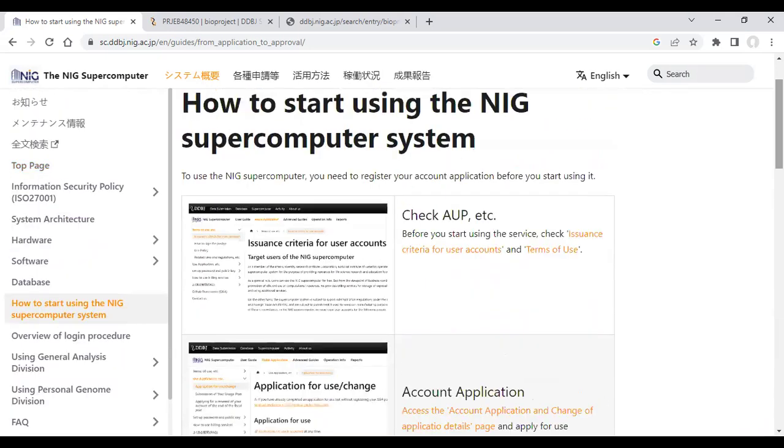Okay, fine. So far we have seen how the supercomputers could be used, I mean, how the NIG supercomputer could be used, and we've also seen how the search could be done. Now I will take you to the same homepage, where if you really wish to submit any annotated sequences or any data regarding your nucleotide details, let me show you how things could be done.